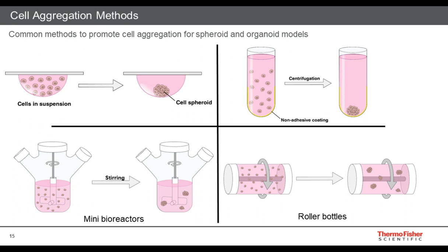I'm sure most people are more adept at simply moving plates that all look the same with different numbers of wells, or dishes of slightly different diameters, in and out of their incubators. But mini bioreactors or spinner flasks use a magnetic impeller, which means they require a magnetic stir plate to turn the impeller to help move the media around.